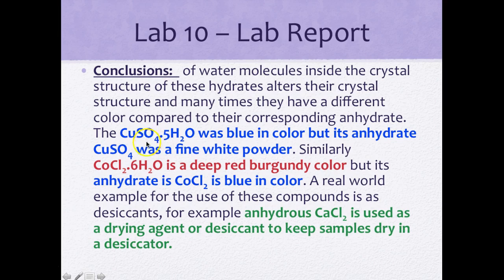Copper ions, when they dissolve in water, have a tendency to have that nice deep blue color. So once the water is taken out, it becomes that whitish color.